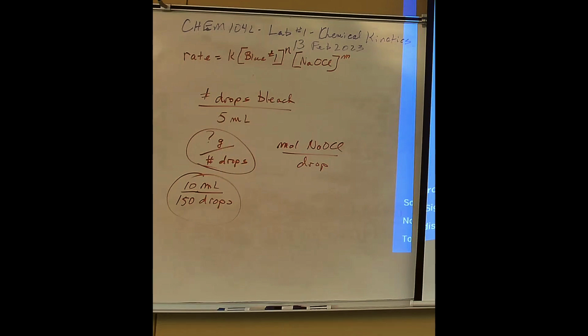We have to put the number of drops to get run 3 minutes or less. Oh, wait, I put that all over here. See, in the procedure, it says stuff that we have to put in the data. So I just circle what sounds like so many data, and I just leave it out of the procedure. Well, but it doesn't matter. You can be like, shoot, I hope I don't get counted off. He's not, okay, as long as you have it.